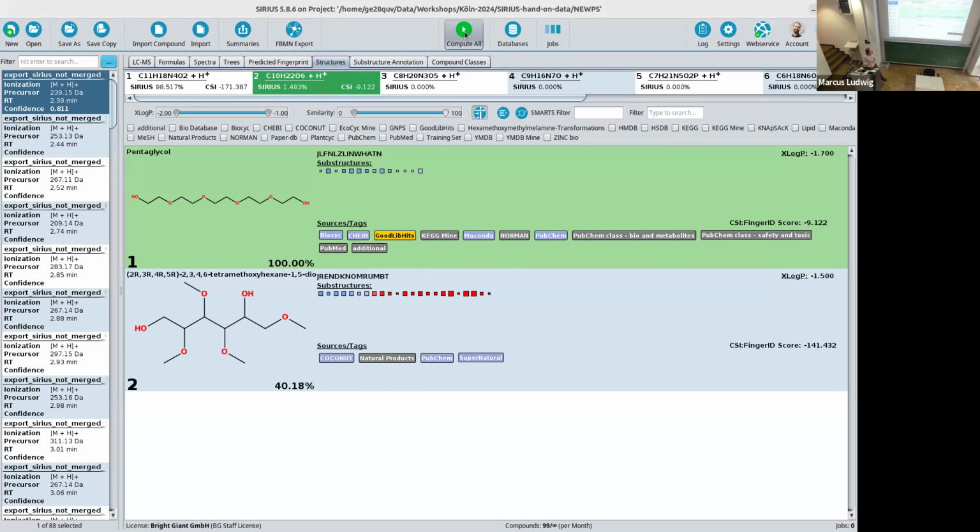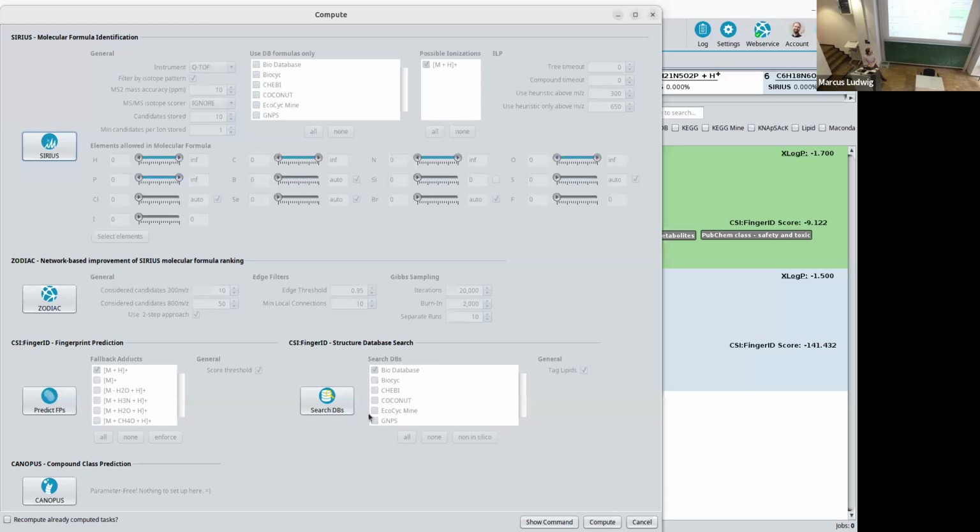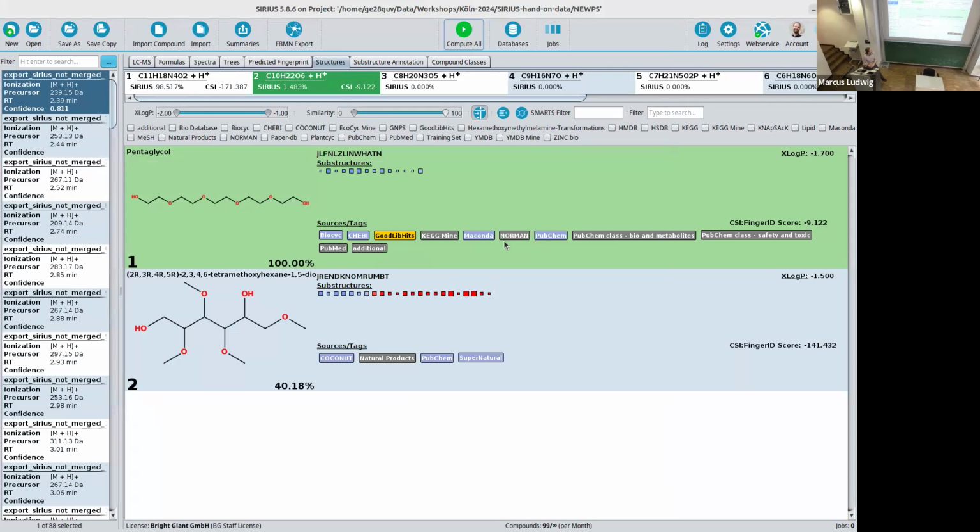You can select them in your list, but you can't click on them to link to the database, because either we don't provide it or they don't have the feature to search for an ID, so we can't automatically open it. And the yellow ones are custom structure databases, which we are going to talk about next. This is a database you can specifically create and search in.